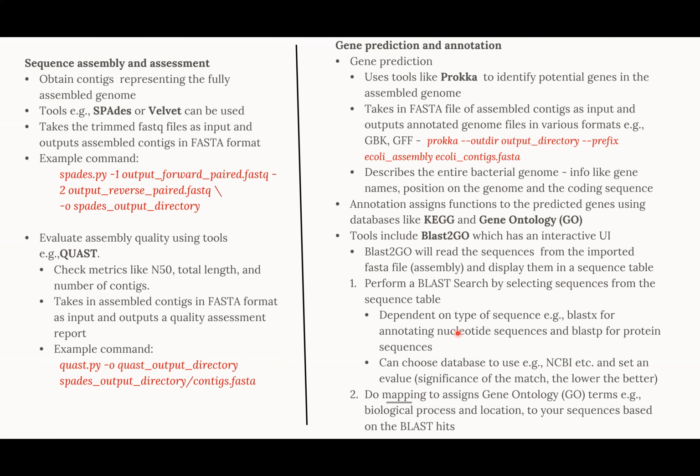This BLAST search is usually dependent on the type of sequence. You can blast a protein sequence or nucleotide sequence, but for this purpose, we're blasting nucleotide sequences. So the type of BLAST search that is performed is a BLASTX. Then you will choose the database that you want to blast against.